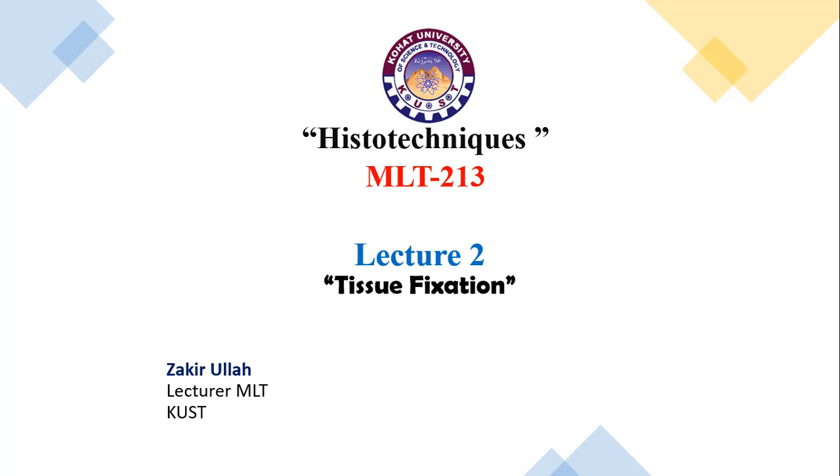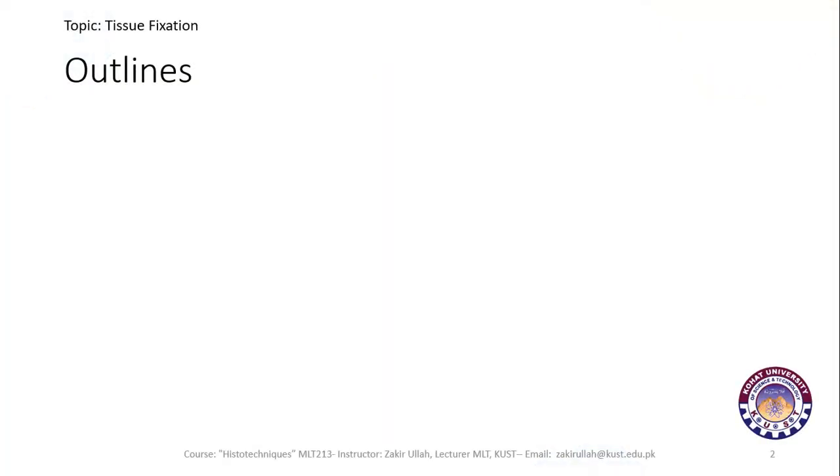Welcome to the histotechniques. Today we will discuss the fixation of tissues which are removed during any surgery or any operation. So, in today's lecture the outlines are the introduction about fixation, that is, what is fixation, why it is important, and what is the function of fixation.